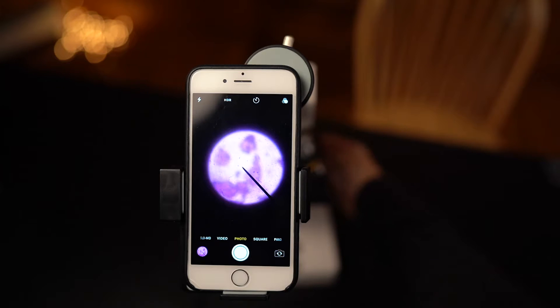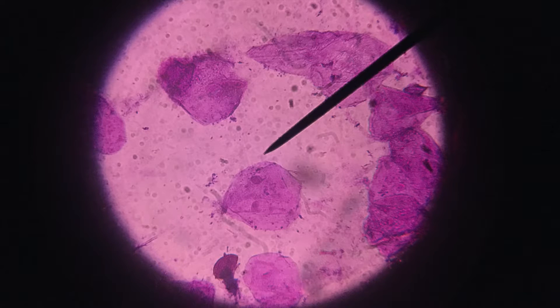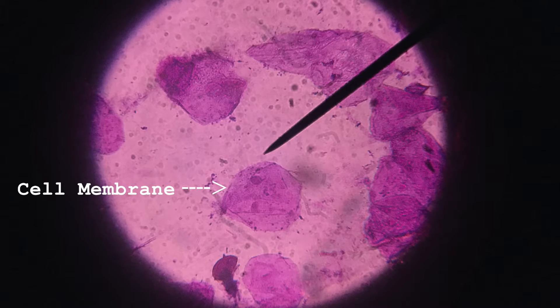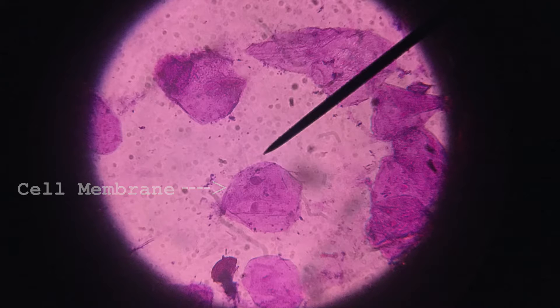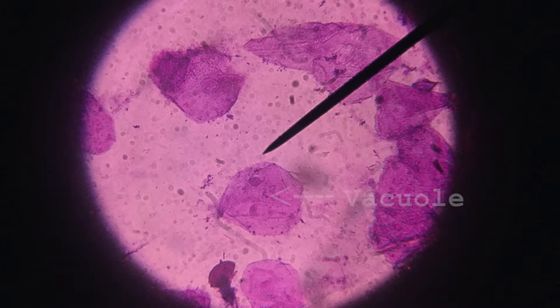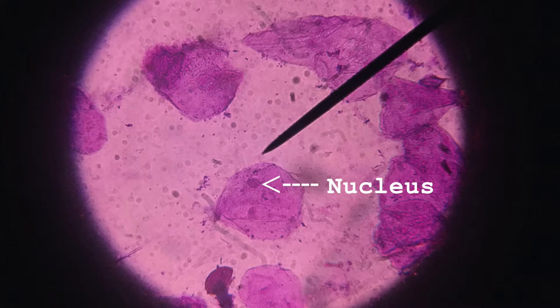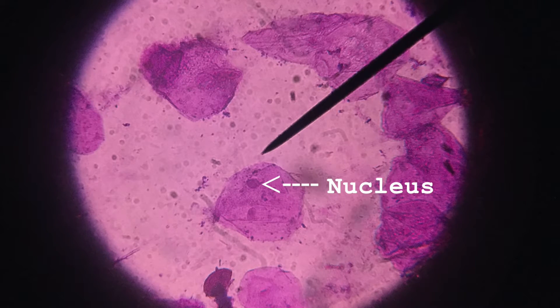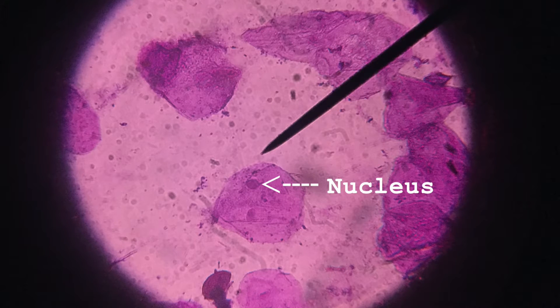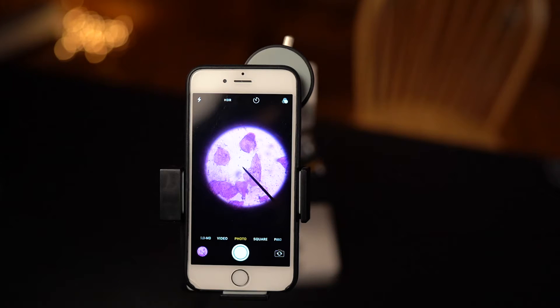Now we are going to go to high power, and this is where we are really going to start to see some of these cell parts. I will focus it up here and get my slide centered. The first thing I am going to notice is the outside layer, which is our cell membrane. Then I am going to look at the pink fluid part on the inside, which is your cytoplasm. These little dots inside are going to be vacuoles that store stuff, and then finally that darker dot inside is going to be our nucleus that controls the cell. Those are the different cell parts you can find under high power.